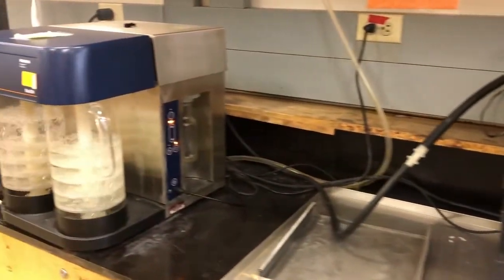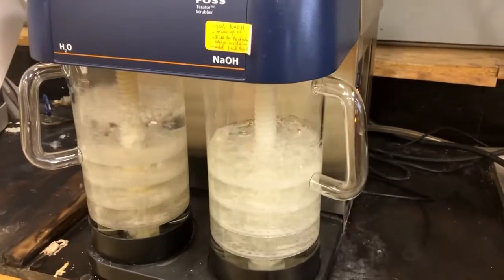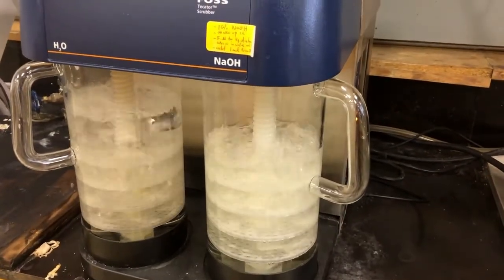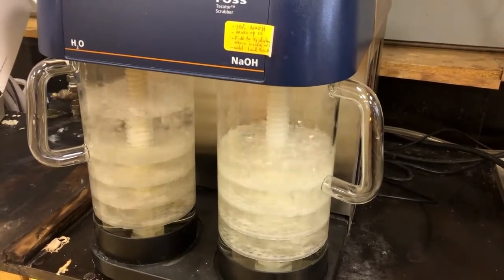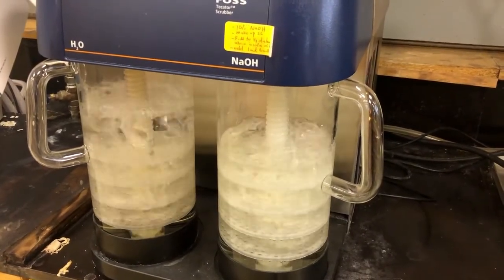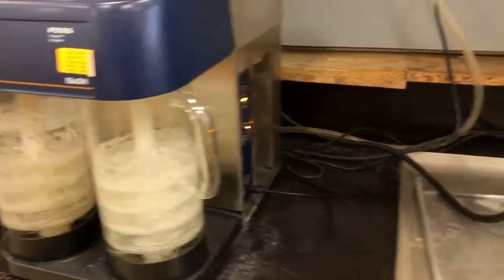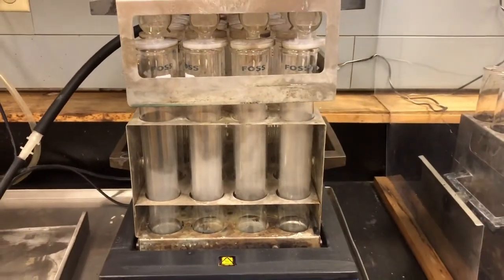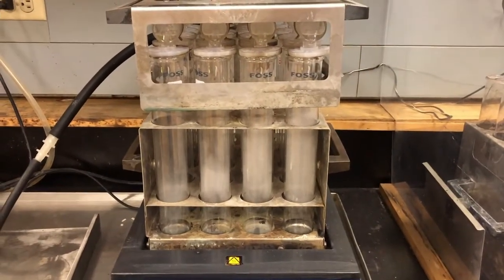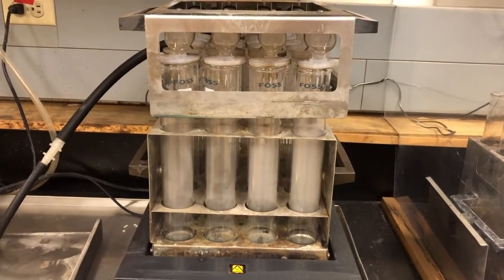Scroll over, you see it's bubbling away. This works in that it has two solutions that the vapors are bubbled through. We have a sodium hydroxide and then a water. And what that does is it neutralizes those acidic vapors that are being given off by the samples in the digestion block. So that's pretty much ready there now. So I'm just going to turn it off. We're going to let it cool down and we'll be back shortly.